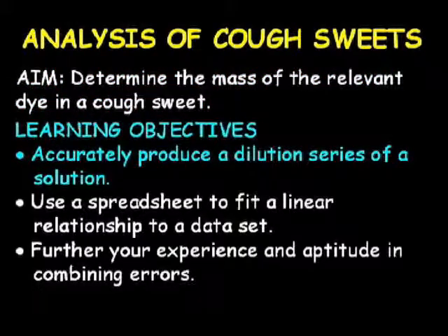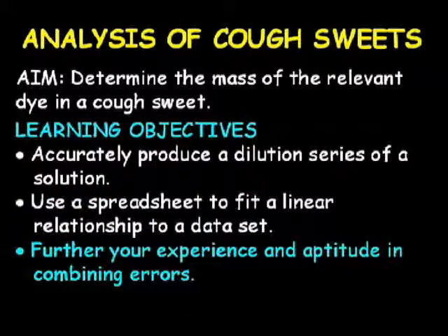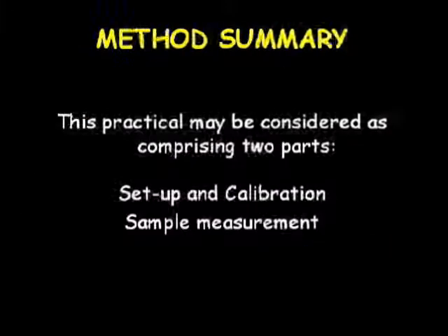Learning objectives are to correctly use volumetric glassware to produce an accurate dilution series of a solution, to use spreadsheet software to fit a linear relationship to a set of data, and to investigate how errors combine and propagate through calculations. The practical comprises two parts.